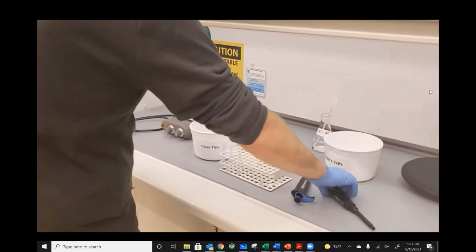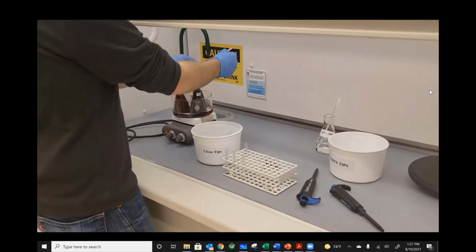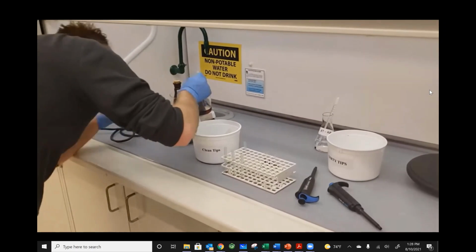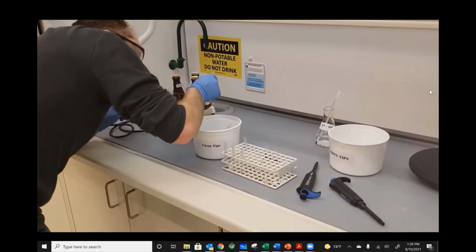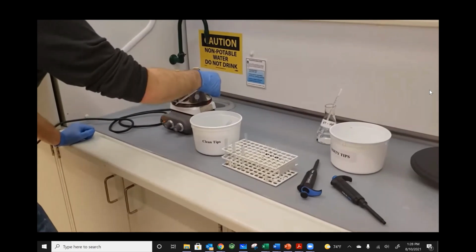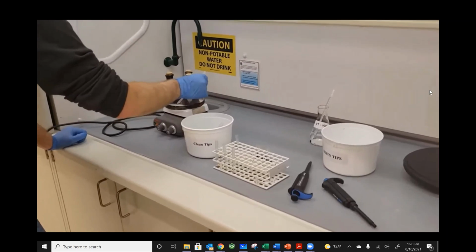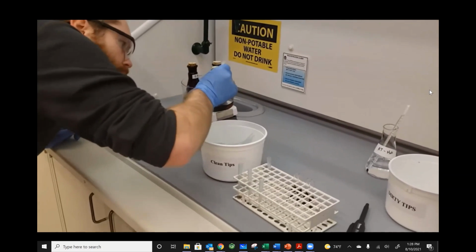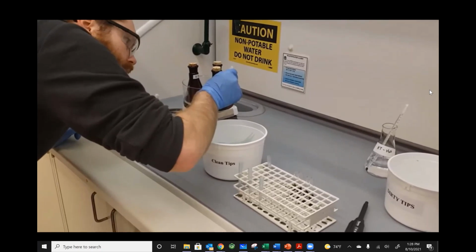First, I need to observe the temperature of our solution. Typically, you should not put your head in the fume hood, but it's hard to read this without doing so. Looks like our temperature is 44.